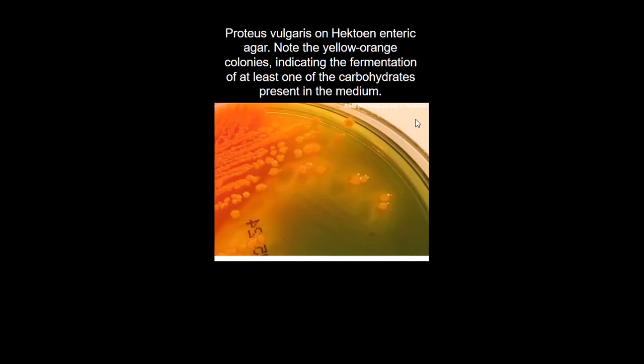We look for the lactose non-fermenters in the media that we are using, whether it's MacConkey agar, HE agar, or whatever.